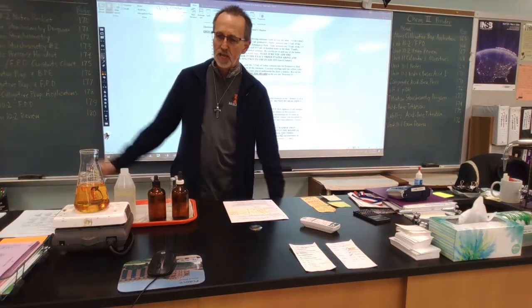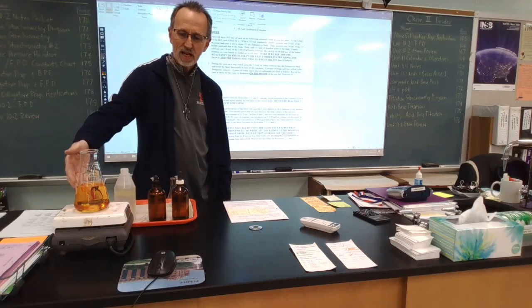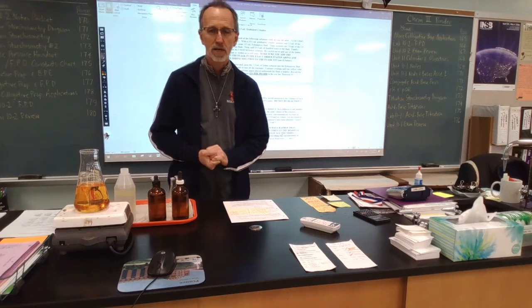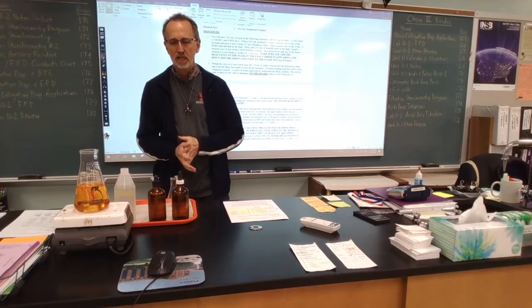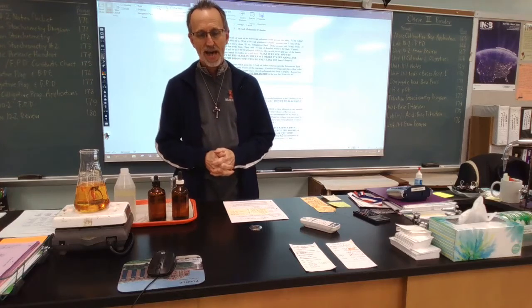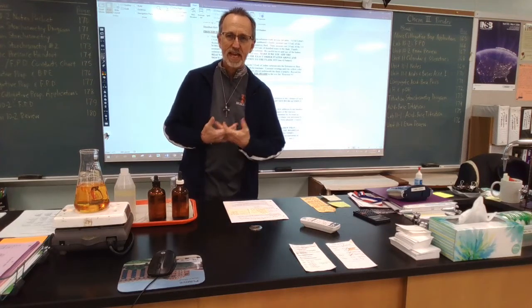I'll explain that. Being constantly stirred, iodine, I2. What's the halogen element that is a solid at room temperature and standard pressure, and it's not very soluble at all.